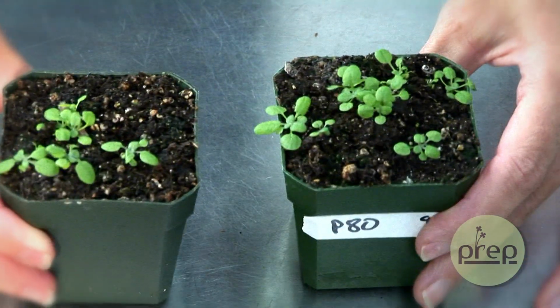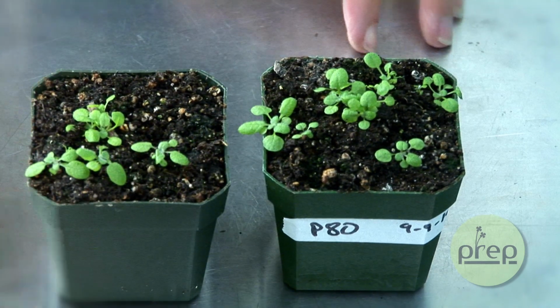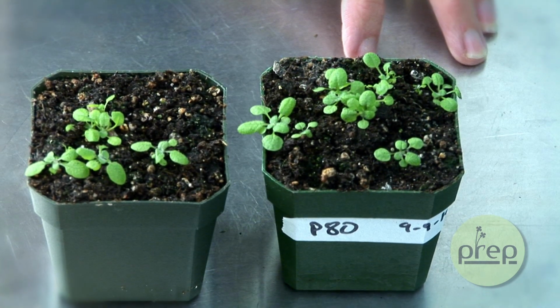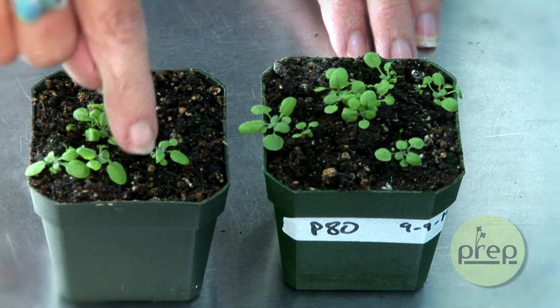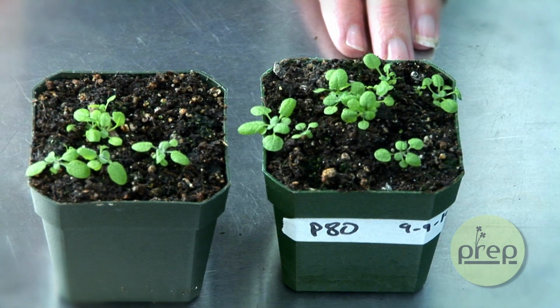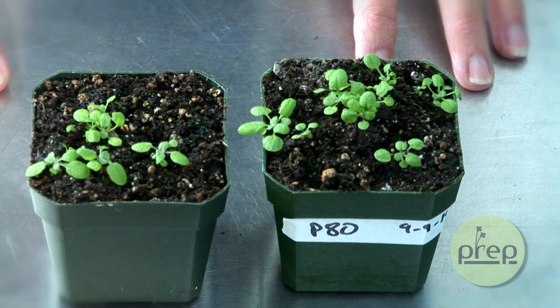So if we have a look at these plants, this is the P80 mutant, and this is the wild-type plant. And grown under these conditions, for the most part, they look very similar. If you look closely, you may notice that the leaves on the wild type can be a little bit more elongated, and on the P80 mutant, they can be a little bit more round. So the take-home message is, under these conditions, P80 looks very similar to the wild-type plant.